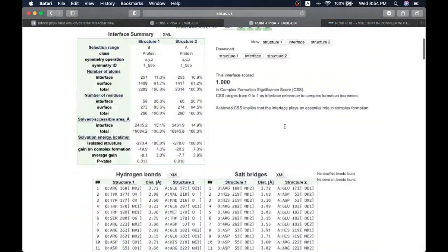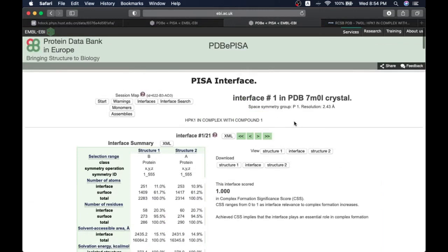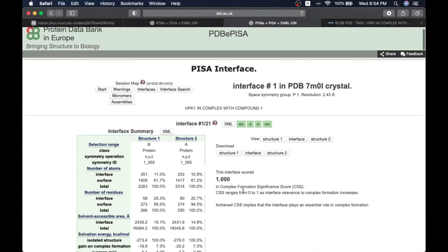You can explore PDBE PISA as one of the powerful tools to get detailed interactions present in the interfaces. The interface score of 1 indicates this is significant to consider as a biological interface.